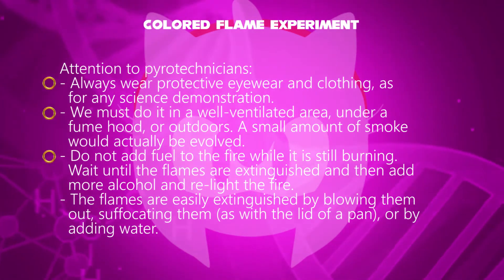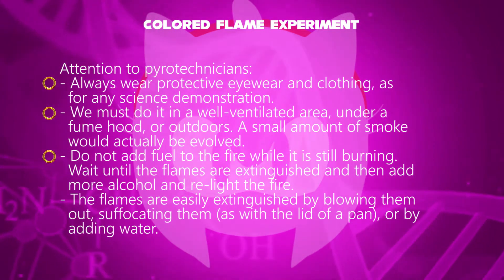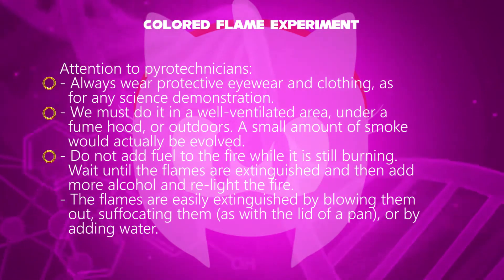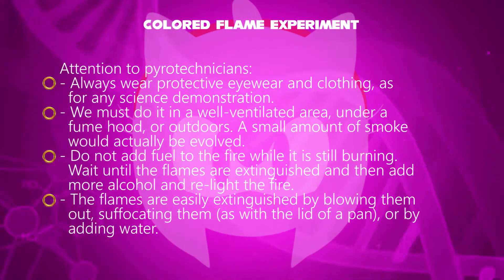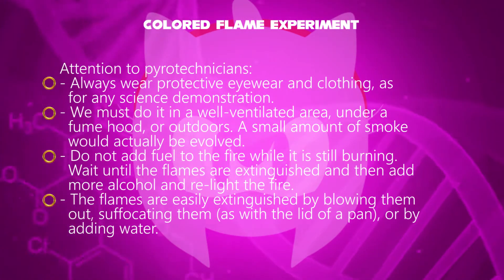Do not add fuel to the fire while it is still burning. We must wait until the flames are extinguished, and then add more alcohol and relight the fire. Extinguish flames by using the lid of a pan or by adding water.